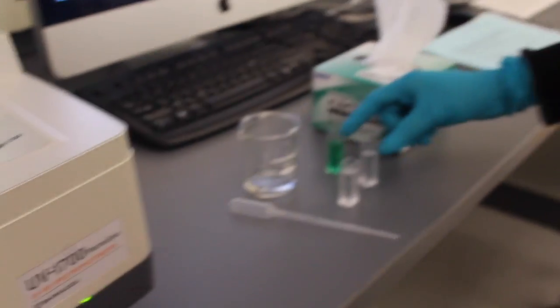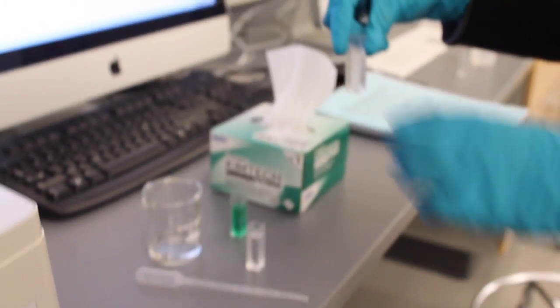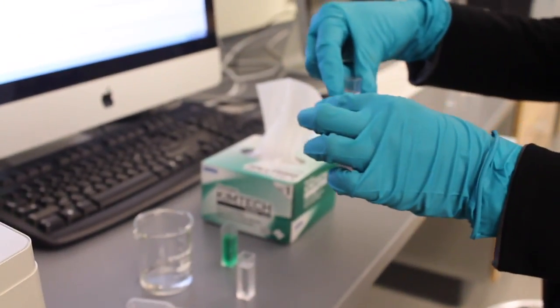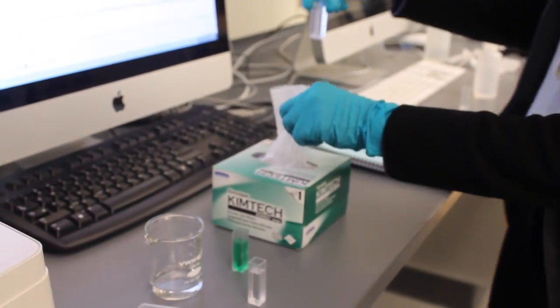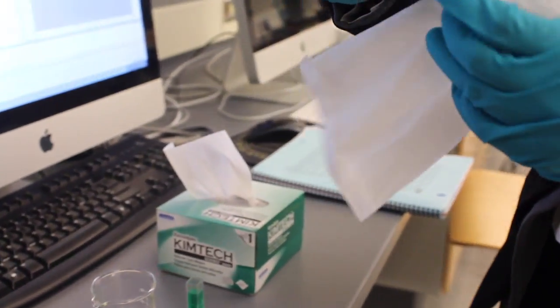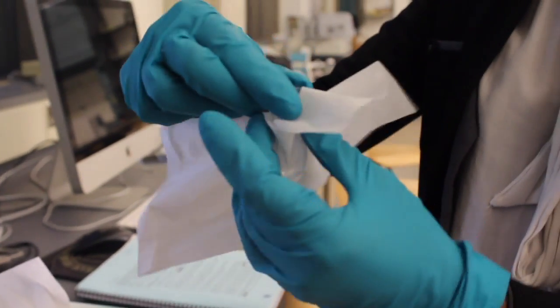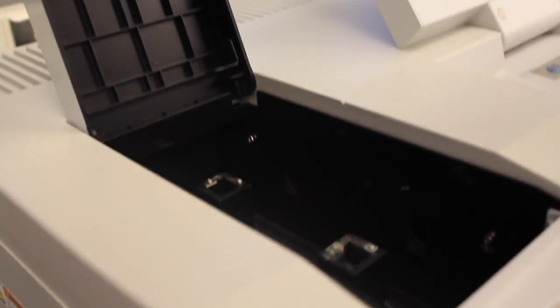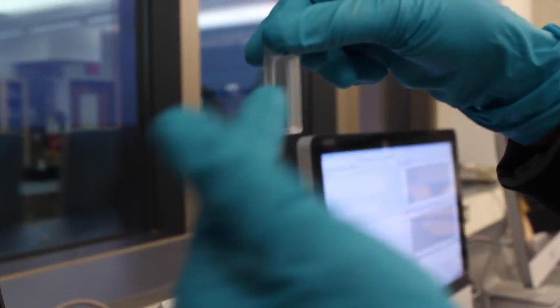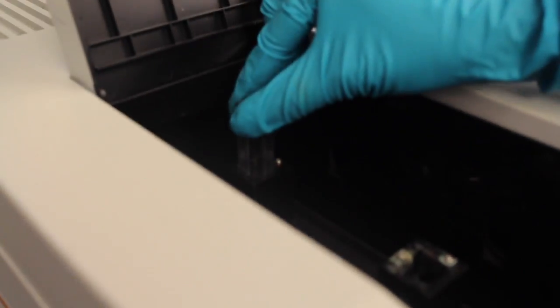Wipe the two cuvettes that contain DI water again and place them in the spectrophotometer. It is important to orient the cuvette properly. The clear sides must be on the left and right hand sides.